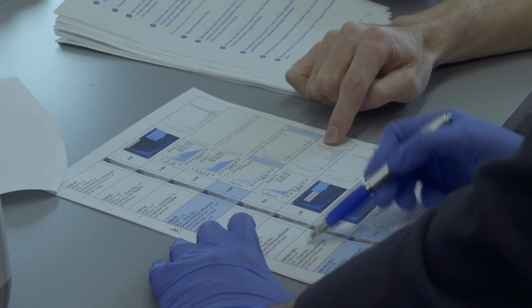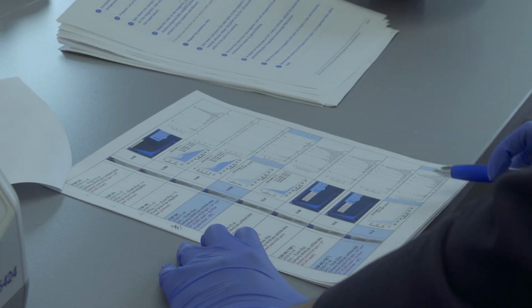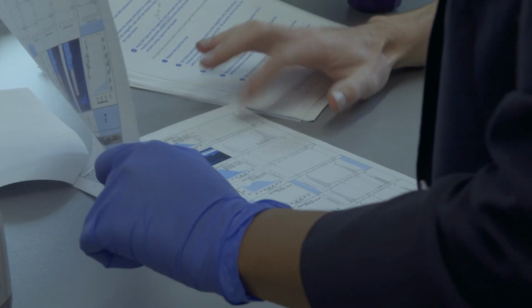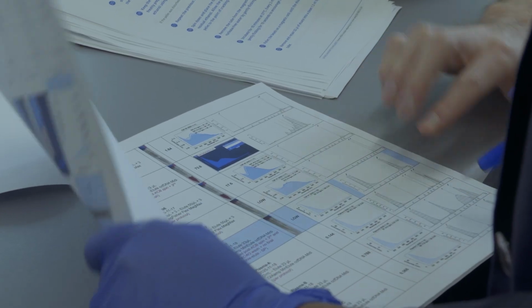Again, this is the same sample, different protocols. This would be the most optimized, but again, you can see a ton of gDNA here. Let's see if there is anything else. No, similar to 5. These are all that protocol. This one was just weird.